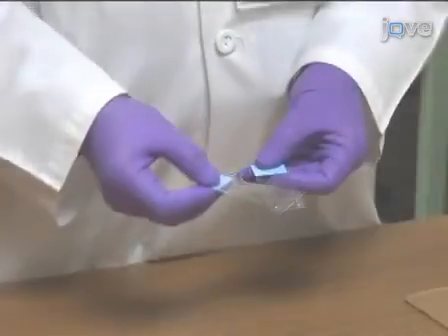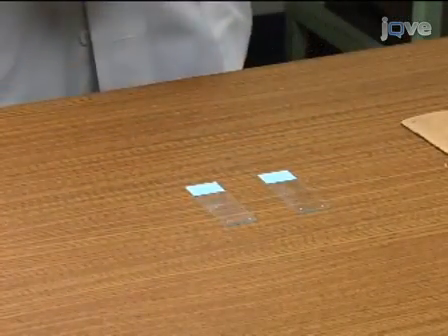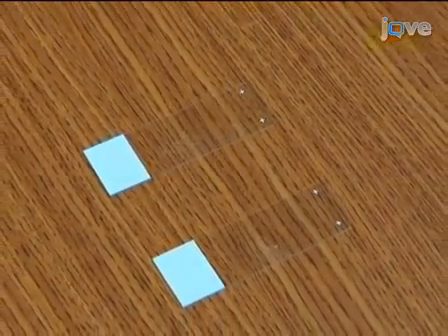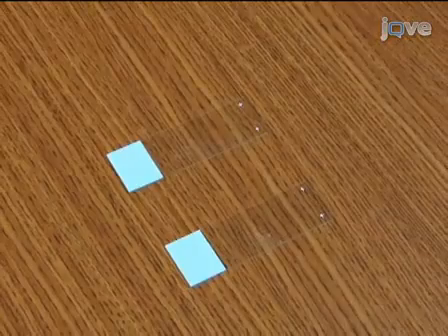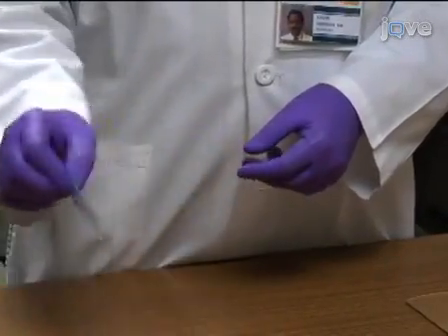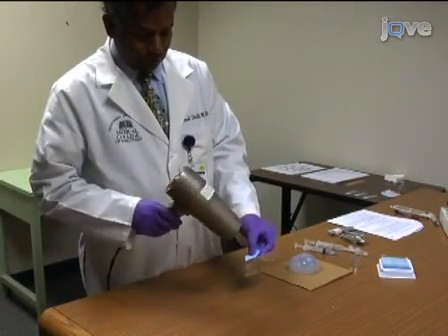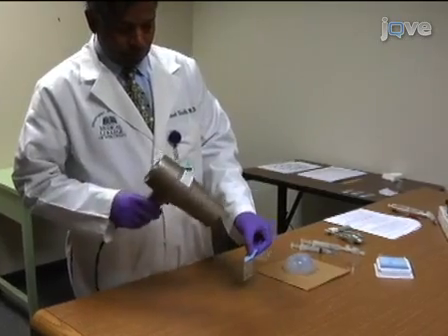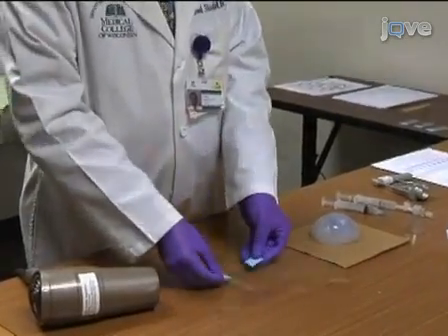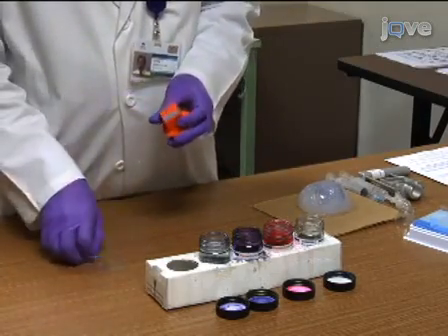Once you have prepared the smears, you can process and fix them in a variety of ways for different staining methods. The best approach is to air dry all the smears rapidly within 1 to 2 minutes. The drying of the thicker and more wet smears may be expedited by moving the slides sideways in air, or preferably with a hairdryer or handheld battery-operated portable fan. When using a fan, be careful to prevent aerosolization, especially for lesions expected to be infective. Once the smears have dried, stain them as appropriate for your experiments.